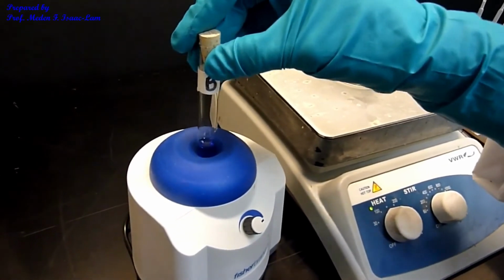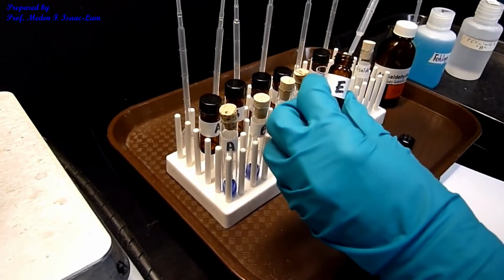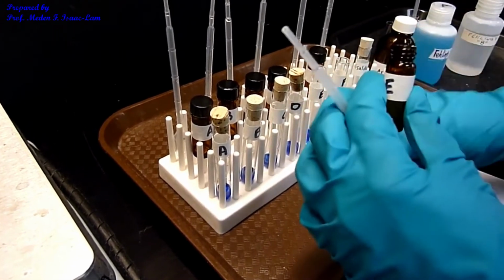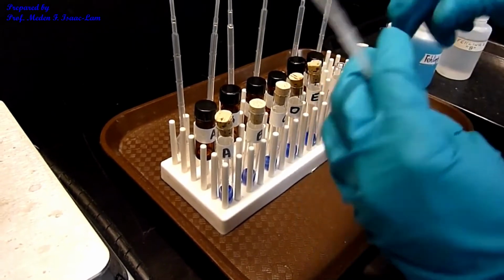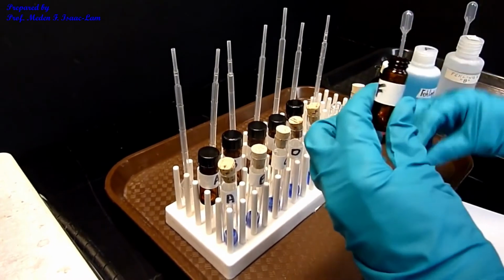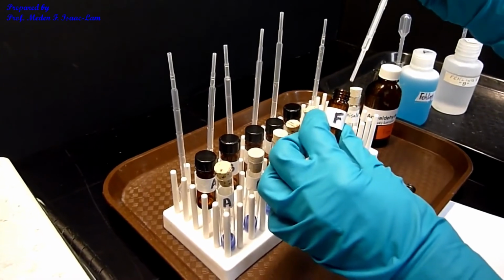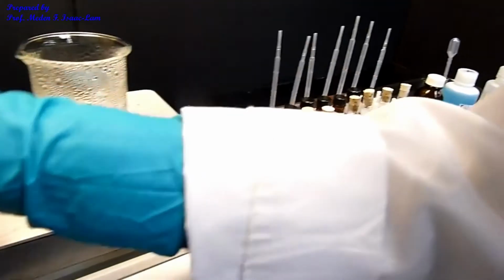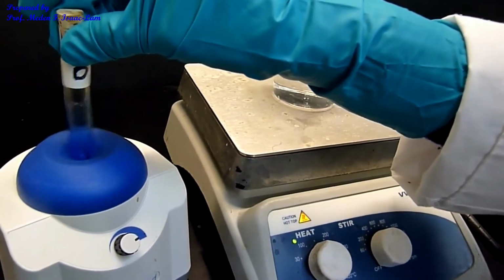So that's unknown B. So that's unknown E. And finally unknown F. So this is now unknown F. So let's mix it up, and then we're going to boil it for about 10-15 minutes.